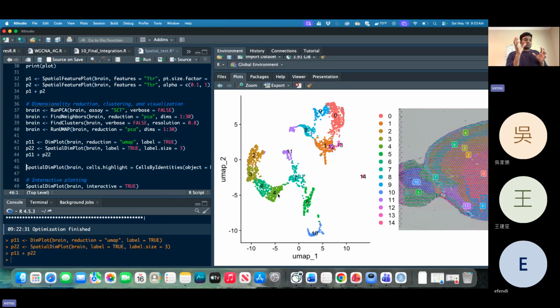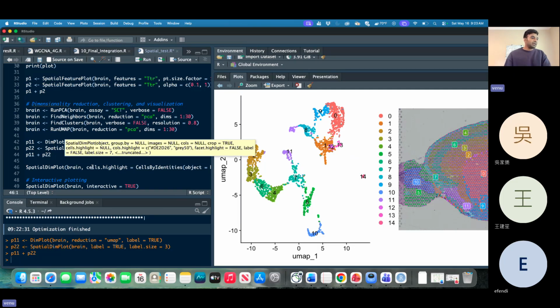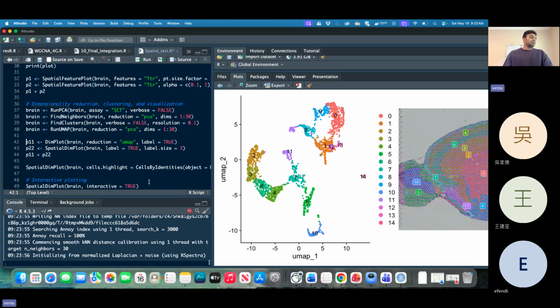So these cells are showing similar pattern and similar interactions, and we found this is a new cell type because this marker is highly associated with these cell types. I think I can explain that better next time. Right now we can just see another example.